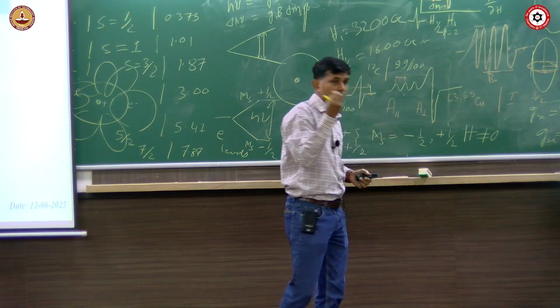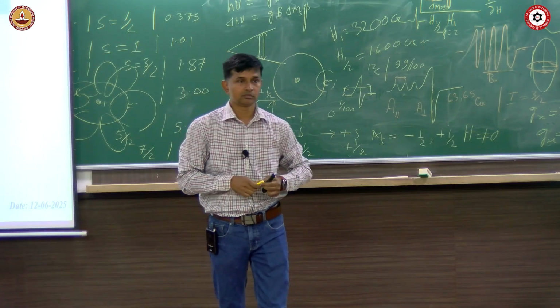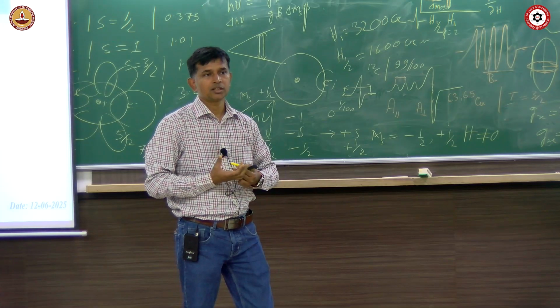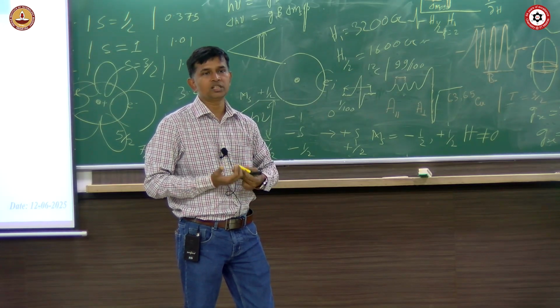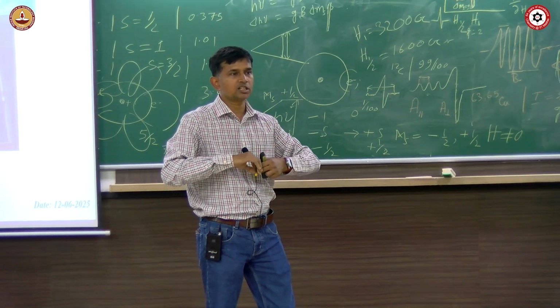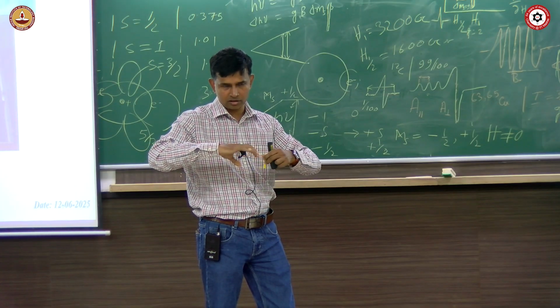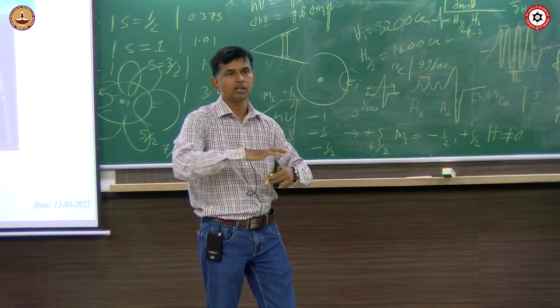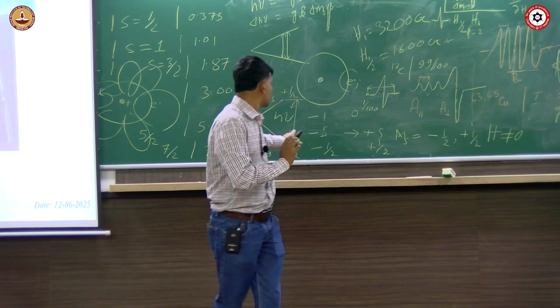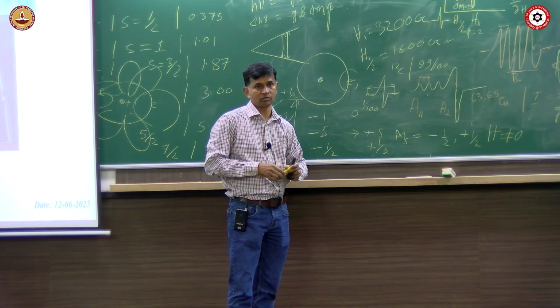So if you put a carbon dot minus and a methyl radical, the coupling constant will be different. Why? Because in the carbon atom the electron has to stay only on carbon, and in the methyl radical the electron can still go towards the hydrogen, and the spin energy and orbital environment are different, so the coupling constant will slightly change. Sometimes the difference is distinct, not little, maybe a lot. Okay.